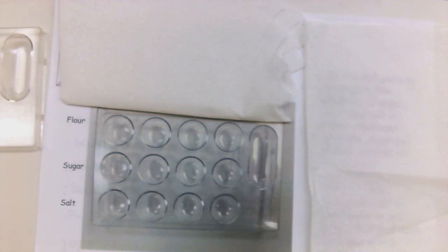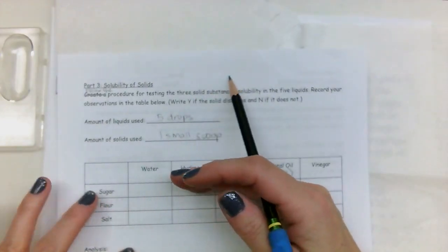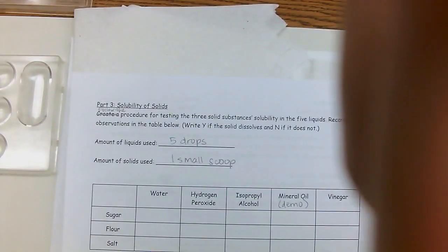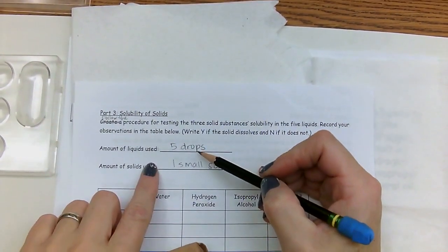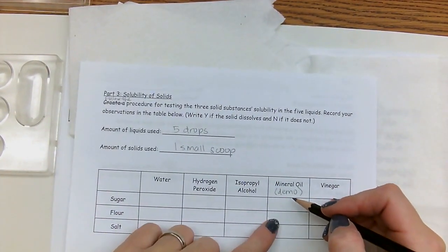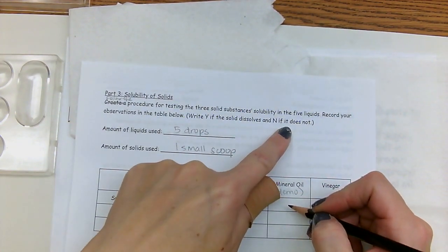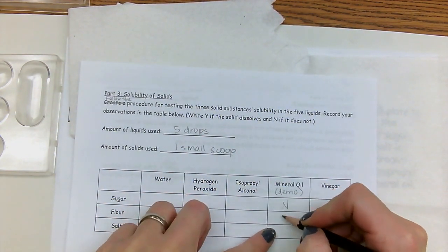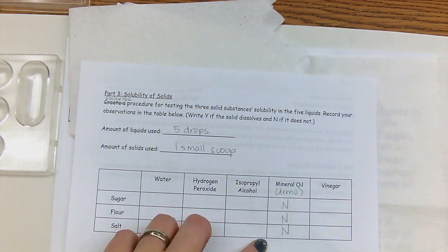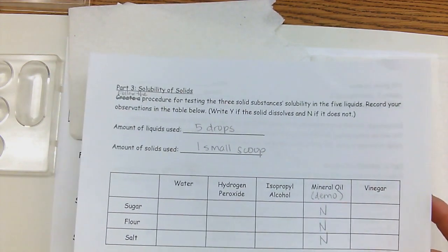So what you see is that, and again, here it says 5 drops of the liquids and 1 small scoop of the solids. And then here for mineral oil, we saw that it did not dissolve, okay? N, so did not dissolve, okay? For all 3. Sound good?